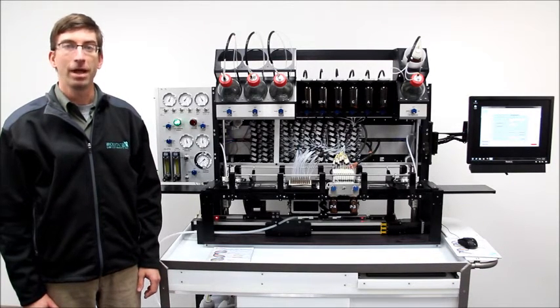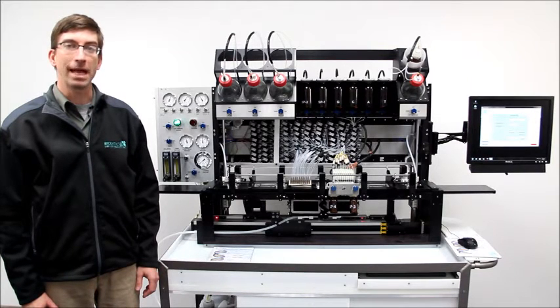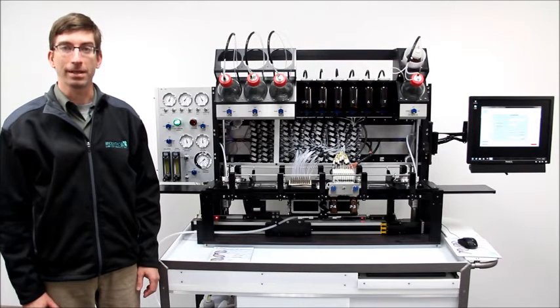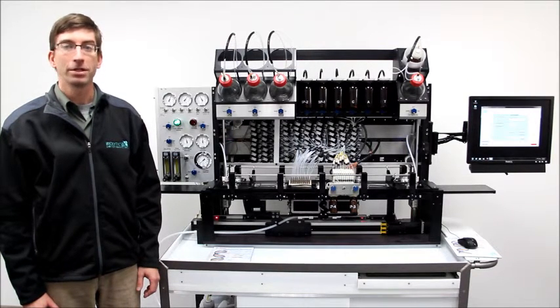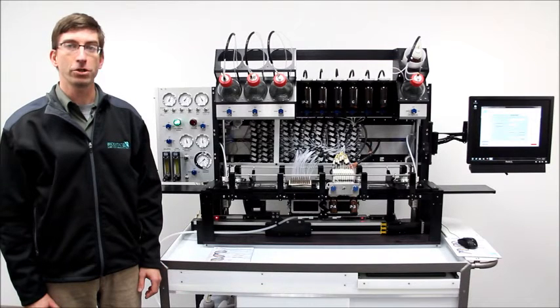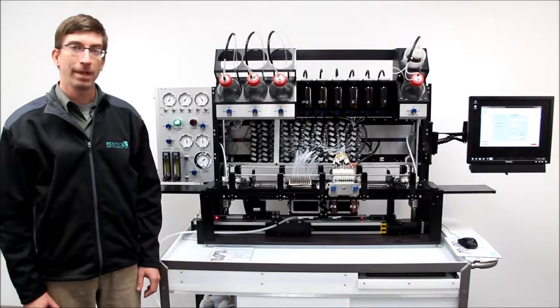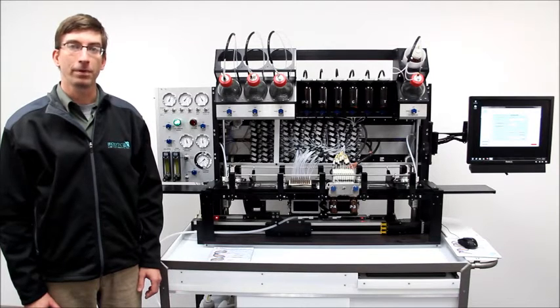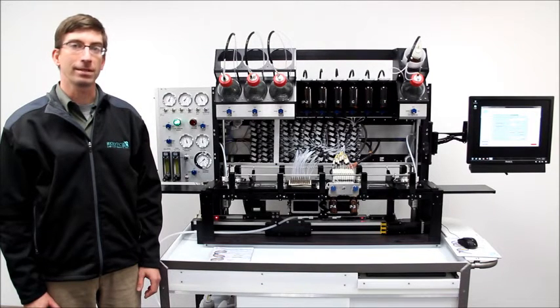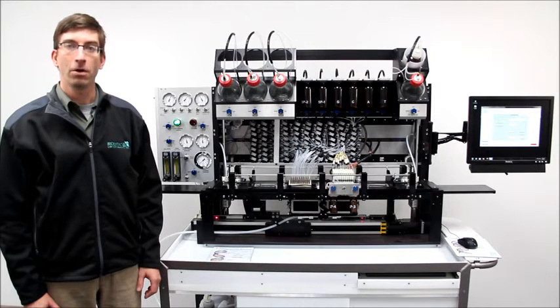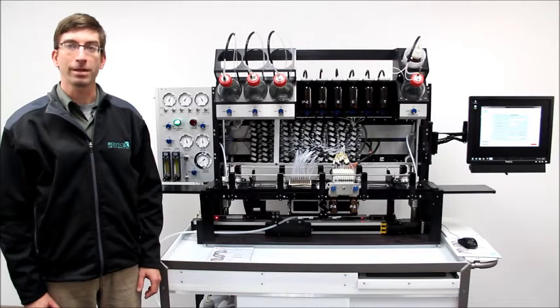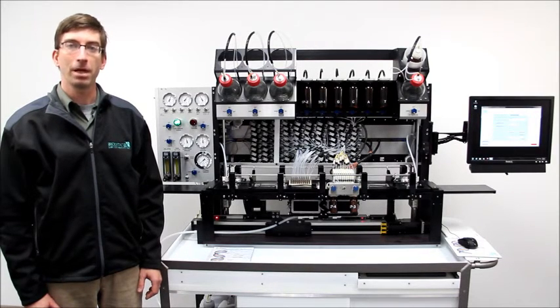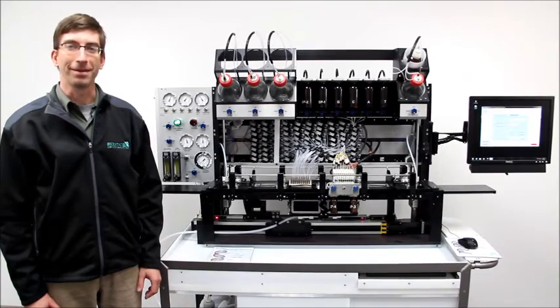Additionally, Biolytic provides accessories for downstream handling of synthesized oligos such as the temperature controlled heated pressure chamber for cleaving and deprotection and the Dr. Oligo Processor for purification of synthesized oligos. For more information on these or any of our products, please visit our website at www.Biolytic.com.